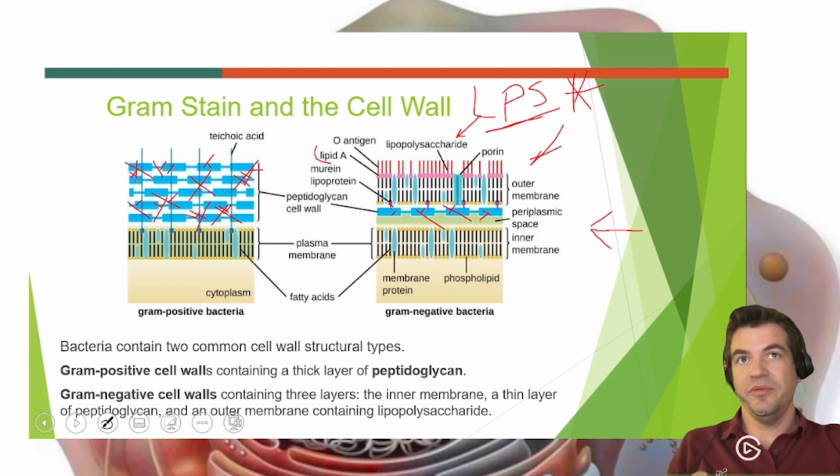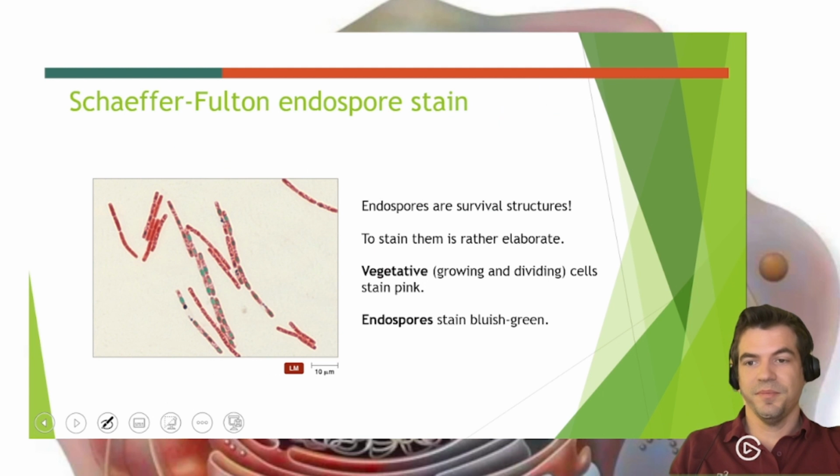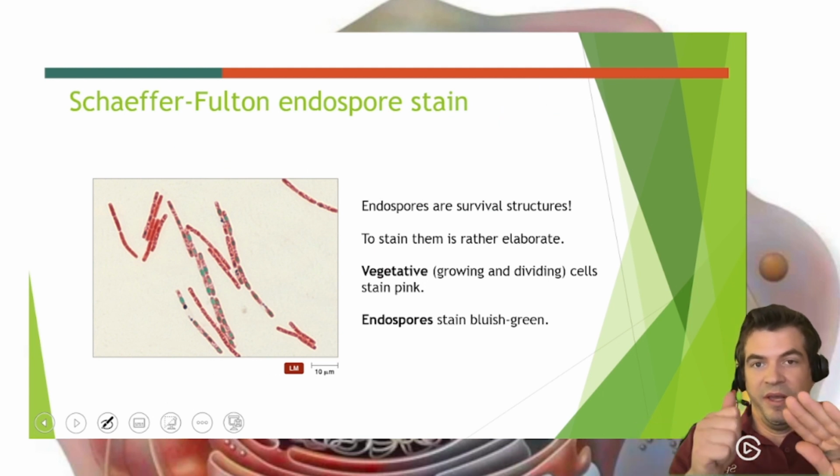I hope you take to heart all the gram staining information that you've been given. It's going to be highly important. If you have any questions on gram stain, please ask. We'll go over it again and again in the lab, so we shouldn't have any problems. Purple, pink, purple, pink. So positive is purple, pink is negative. So that's a purple and pink scale.